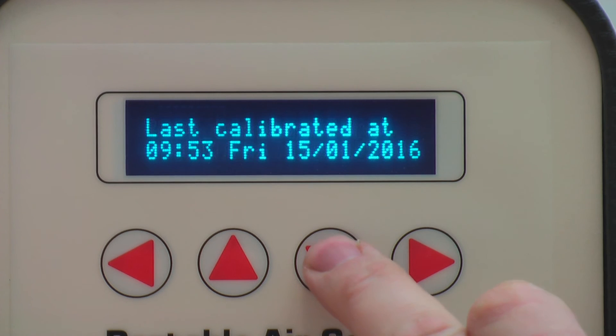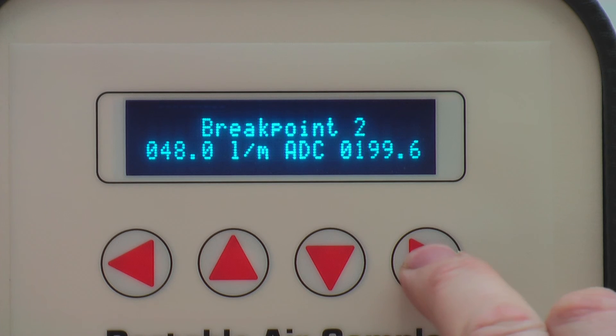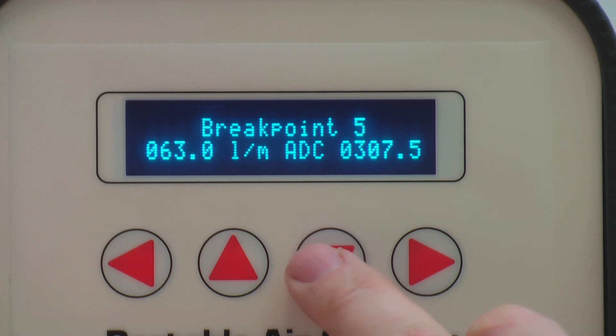All of which are good for air quality control inspection processes which you may have at your workplace. Breakpoint is a diagnostics tool that we use to calibrate the pump assembly. I will advise only allowing Munro trained staff to work on breakpoints unless you have a UCAS accredited flow calibration rig or have been trained on pump assembly at Munro instruments. If internal calibration is something that interests you, please contact us using the contact info at the end of the video.